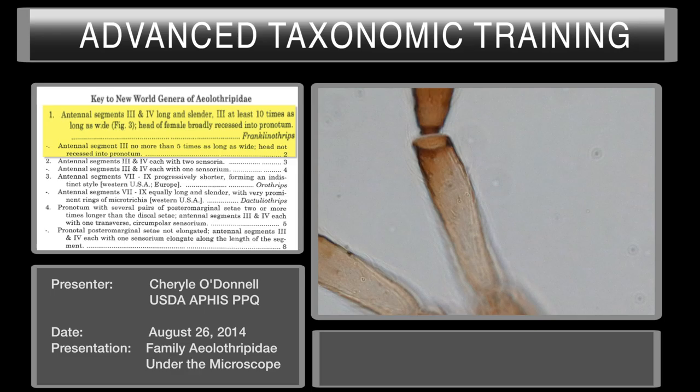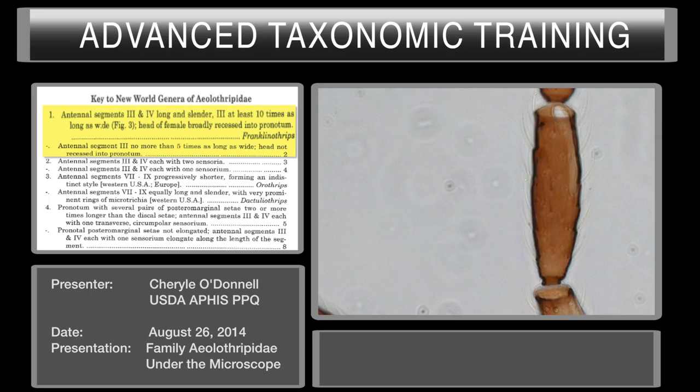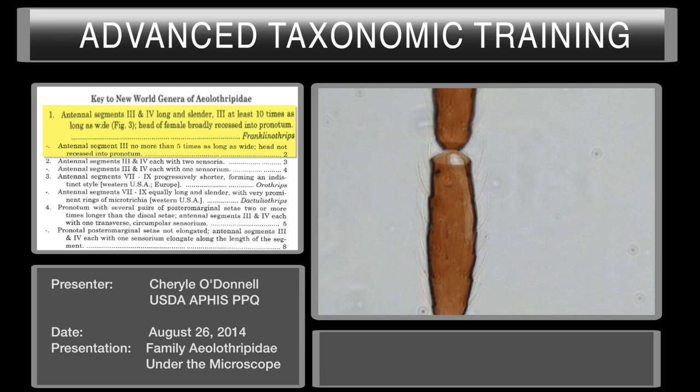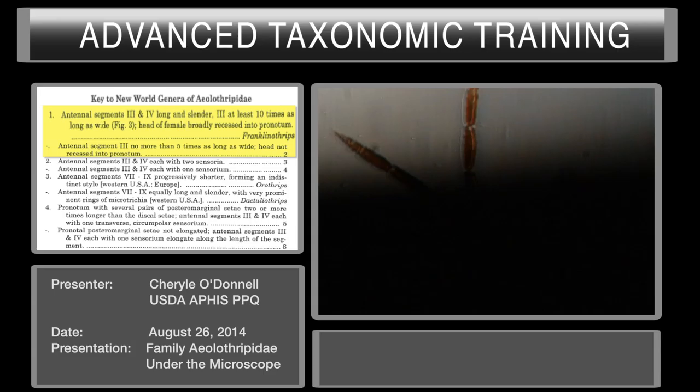Now pull up your next specimen. We're going to use the same Aeolothripidae key from Mound and Murillo. On segments three and four you can see longitudinal sensoria. Sometimes they curve at the anterior end. Unfortunately this specimen is on the back side, which sometimes happens, but there is the sensoria right there. It is also at an angle — it may be linear here and then actually sort of curves along the lateral line of the anterior of that segment. But that would be the longitudinal sensoria on segment three.